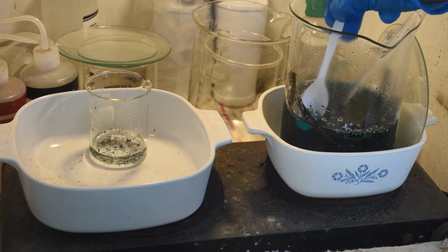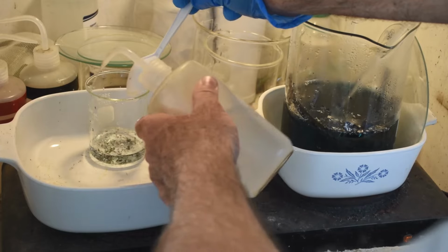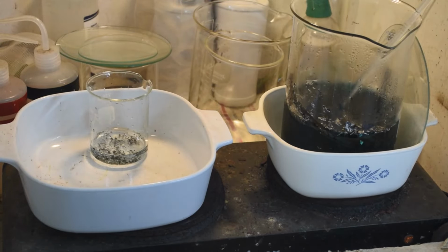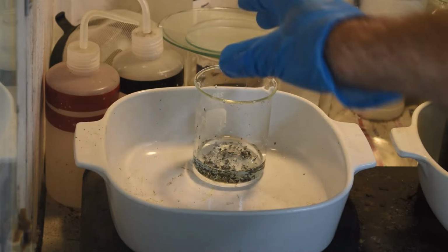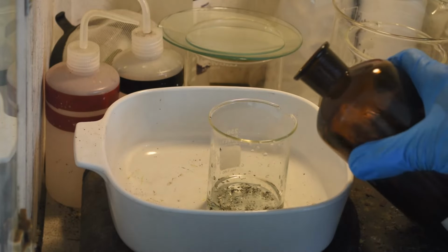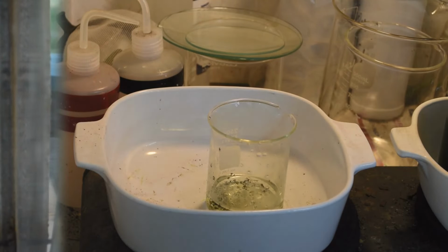Yeah, I'm getting quite a bit skimming off the surface here, and I'm getting it relatively free of that blue-green stuff. So I think that's probably enough right there to tell me whether there's any palladium in it or not. So what I will do is put a little nitric acid on this stuff, and we'll see what happens.